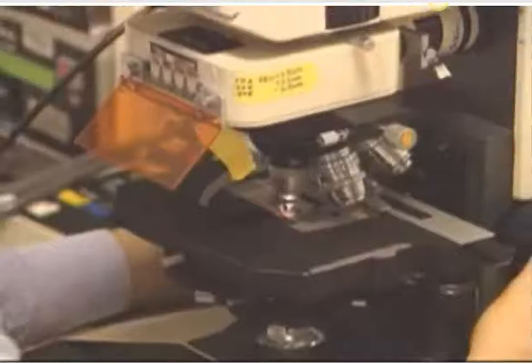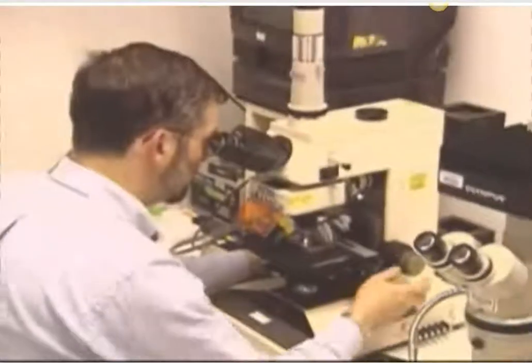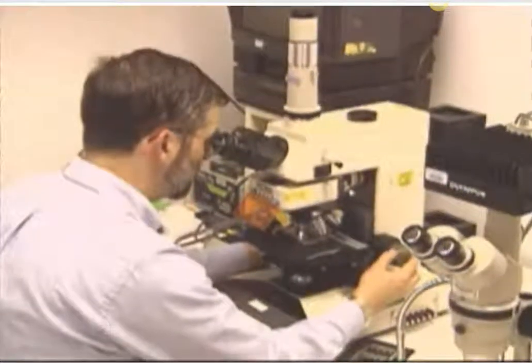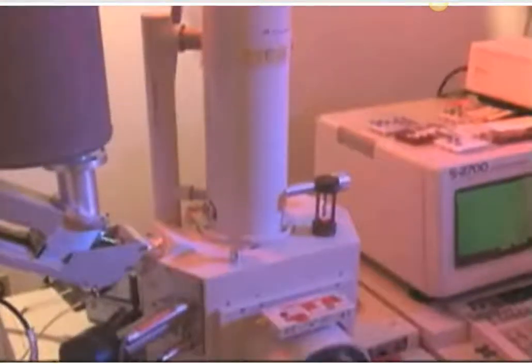Today, the microscope continues to be the principal tool used in medical research. When cures to today's diseases are found, it is certain that the microscope will have played an important role. Both the traditional light microscope and the electron microscope, an instrument that uses electrons to magnify rather than light.